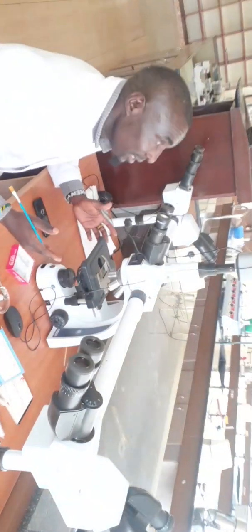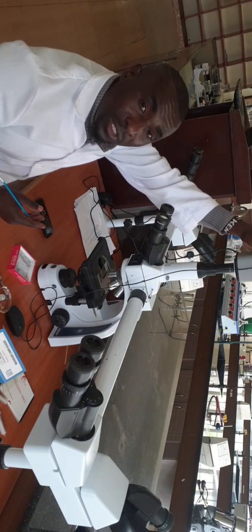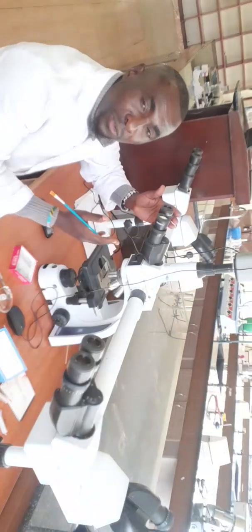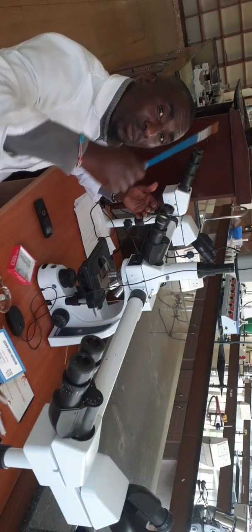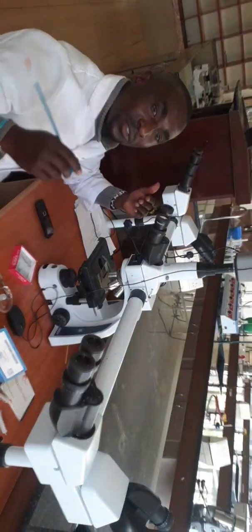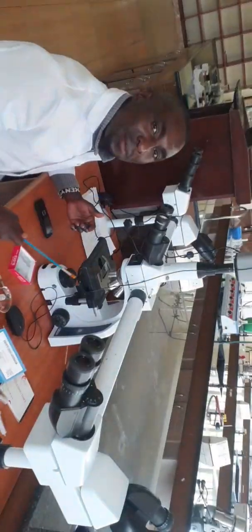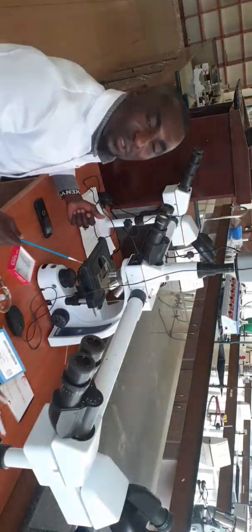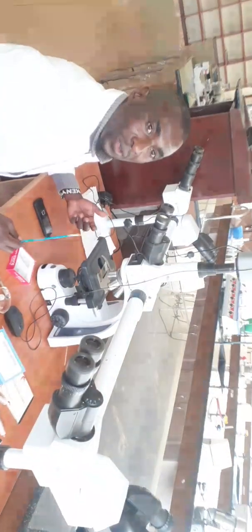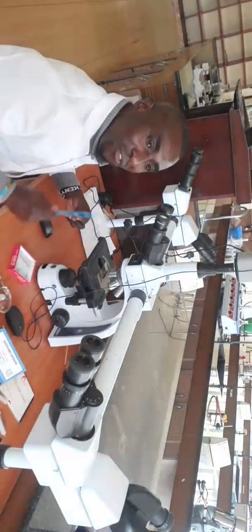This camera also allows another cable to be used. You can save the specimen in a memory card, or when you're projecting it using the HDMI cable, you can still take a photo and make sure that the specimen you've been observing, you can take a photo of it, take a video of it, and then save. That is what this microscope is helping us with, a very important and more advanced microscope. And it also provides a very clear specimen.